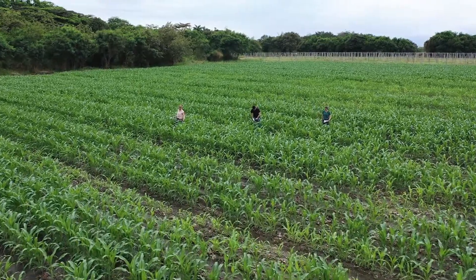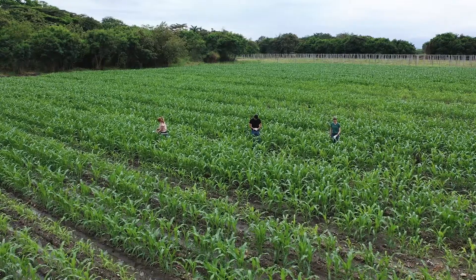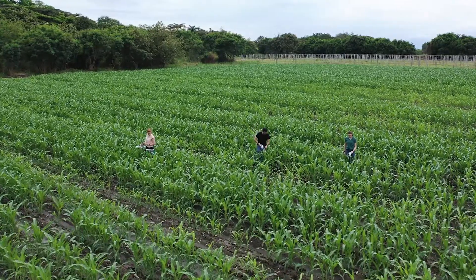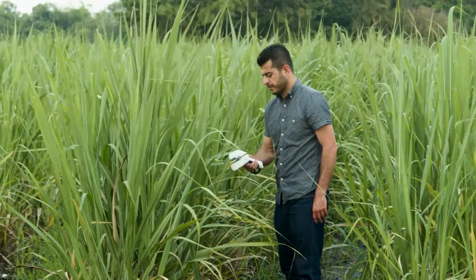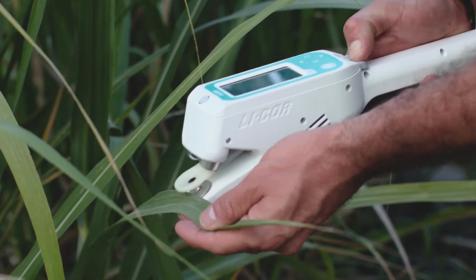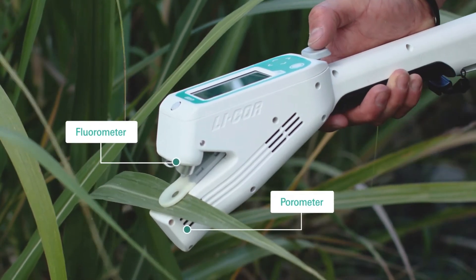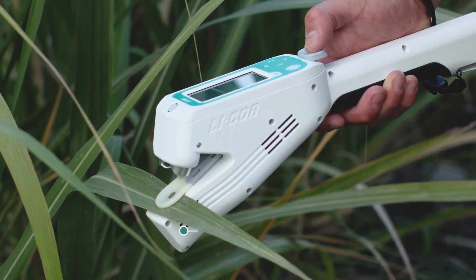When it comes to collecting data, it seems like your plants are abundant while your time can be a little scarce. But just because your plants are stressed doesn't mean that you have to be. The LI600 Porometer Fluorometer is a handheld device that measures your plants in seconds. It is designed to expedite your high-throughput studies by measuring stomatal conductance and chlorophyll fluorescence on the same leaf area.